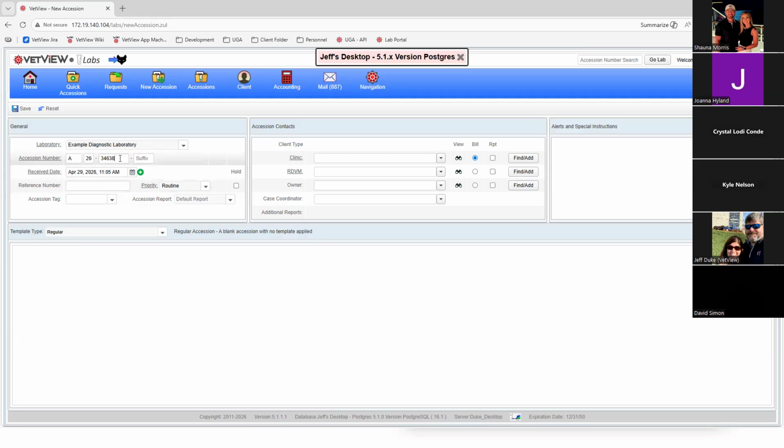If you have it on auto numbering, then it's going to just give a number when you hit the save button, and then there's no real options there. In that sense, it just assigns it out as each one is assigned. As you hit the save button, it's assigning that number out.